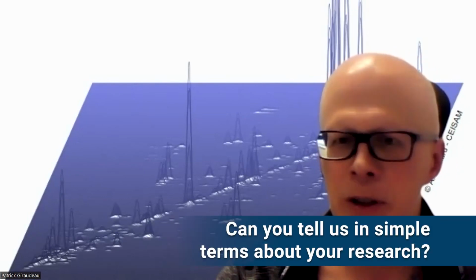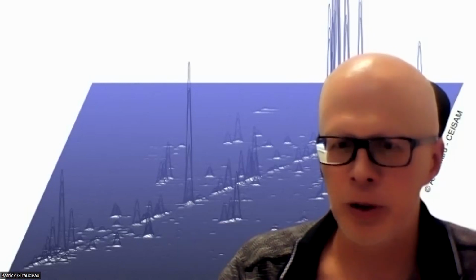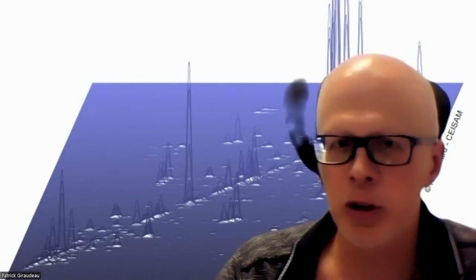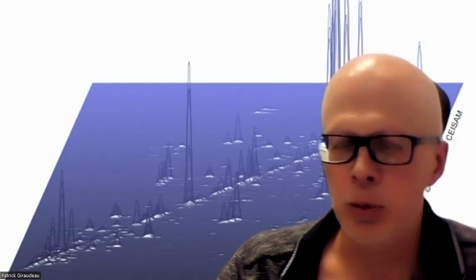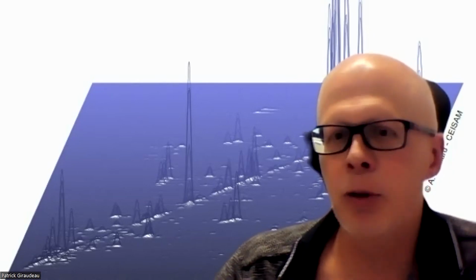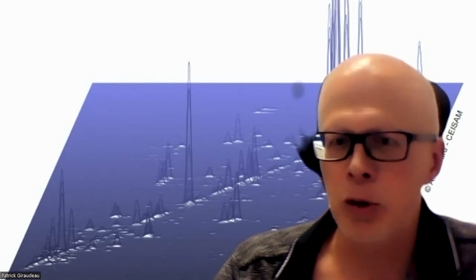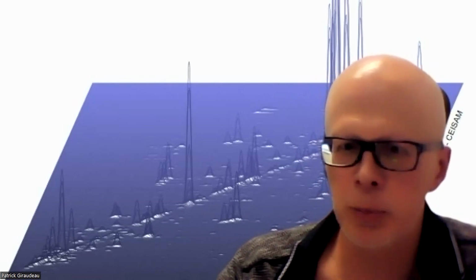So our main research field initially is to develop new methods for the analysis of complex mixtures based on NMR, and more specifically, quantitative methods. So what we want to do is to be able, in complex chemical and biological mixtures, to quantify multiple analytes at the same time. And for that, we like to design new experiments, what we call in NMR pulse sequences, which are different ways of playing with nuclei in order to get the answer that you want to get. And then these experiments, we implement them on a variety of spectrometers, high field spectrometers, but also on benchtop spectrometers.